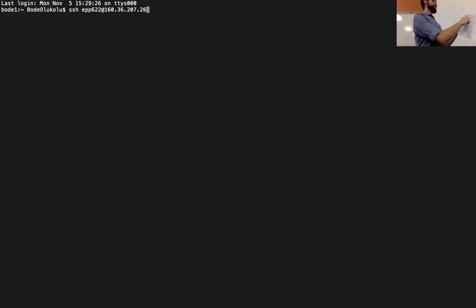For right now, I'll have us skip past this part about downloading the images. I still do want to do that, but for now, we want to go ahead and start getting our alignment going, because I think the first part takes 9 minutes and then there may be 20 or so. And the password? Okay, it's guest at 622.